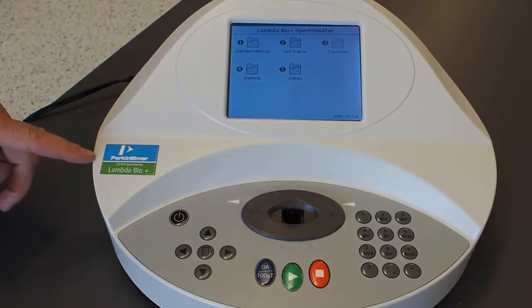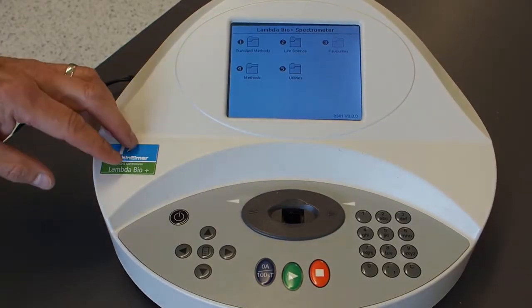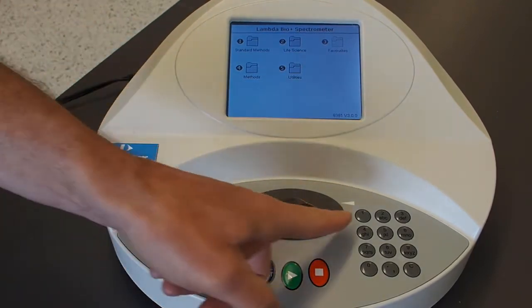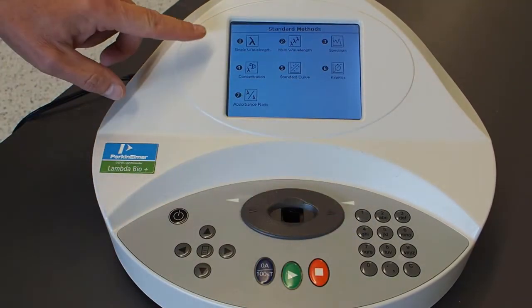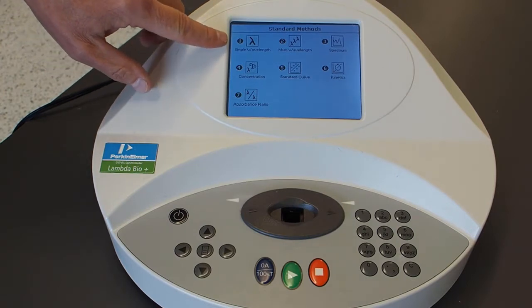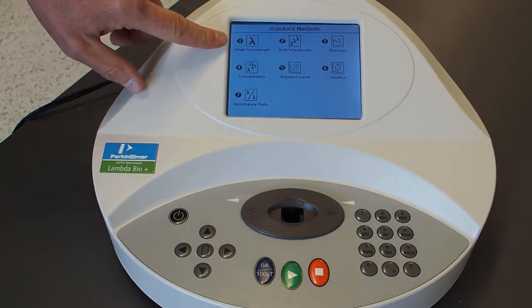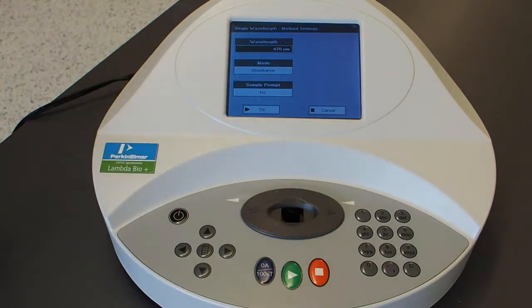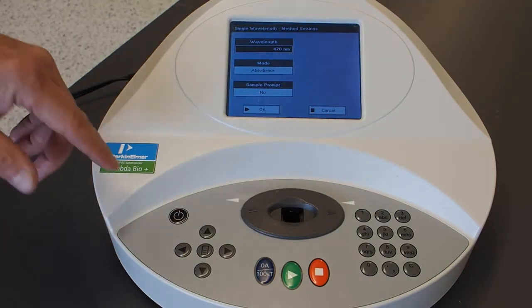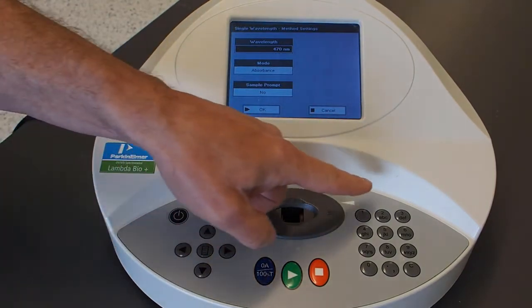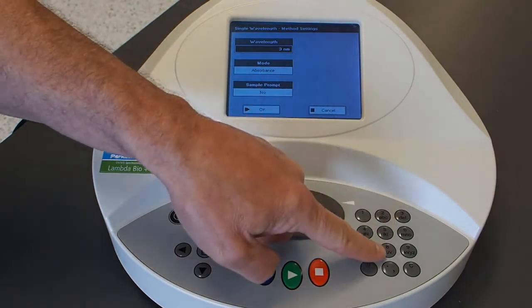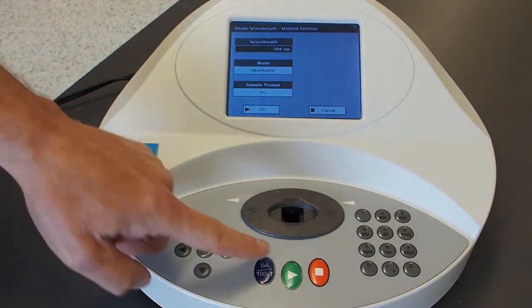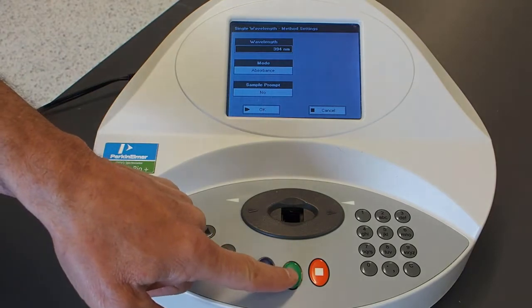We're going to use the Perkin-Elmer Lambda Bio spectrometer. We'll choose standard measurements and measure the absorption at a single wavelength. The wavelength we found to be the maximum earlier was 394 nanometers, so we're going to choose 394 nanometers, and then we're ready to go.